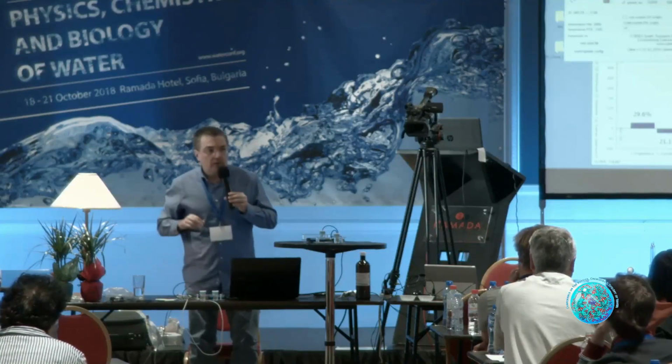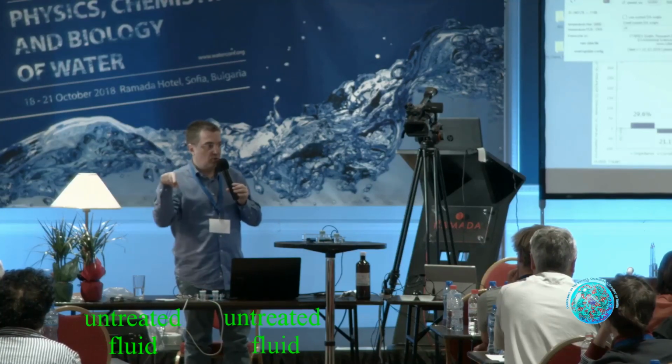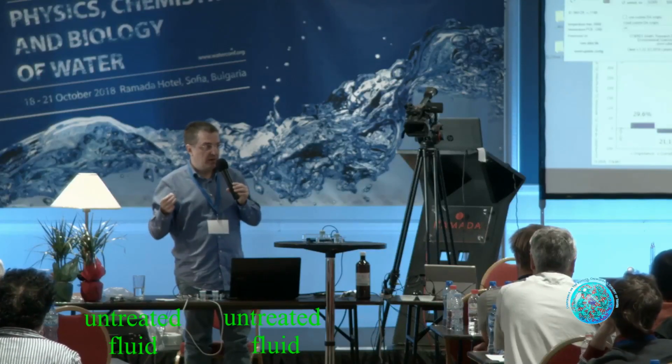What I will do now is just replace one of the channels, from this double differential approach. So we were measuring control to control, and now we're measuring control to experimental. So in this case we perform a kind of relative measurement.